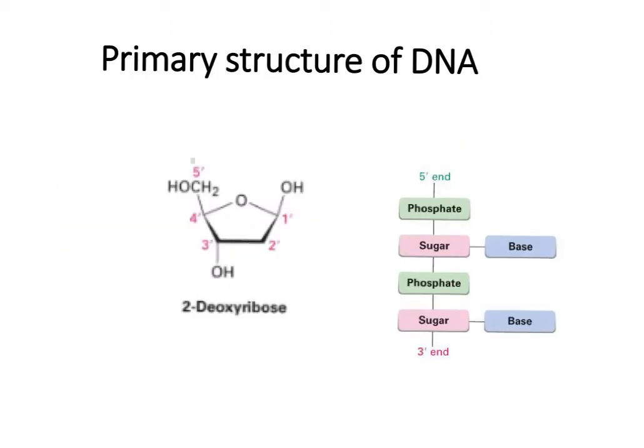The oligonucleotide synthesis is carried out in an automated method very similar to the one that we discussed during peptide synthesis. This is called a solid phase synthesis, and it is carried out on a solid support held between two filters in columns that allow all reagents and solvents to pass through freely.